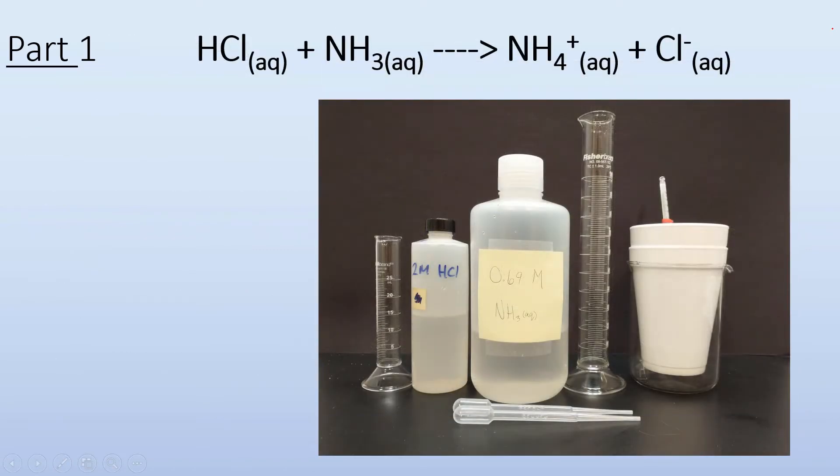In part one we're going to react hydrochloric acid with ammonia to give us the ammonium ion and the chloride ion. Our materials will be 2.0 molar hydrochloric acid which you can see right here in the picture, and 0.69 molar NH3. You might be asking why is this an odd molarity? Well this is what I got over the counter, just kind of cleaning ammonia. So we got NH3 aqueous with a concentration of 0.69 molar.